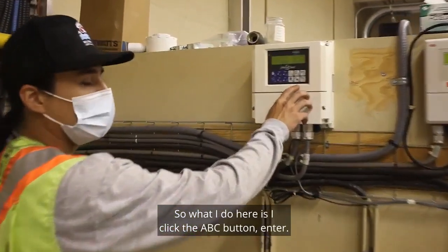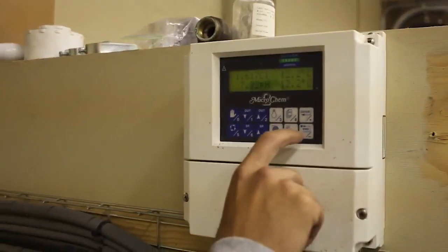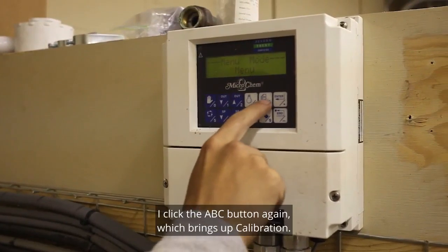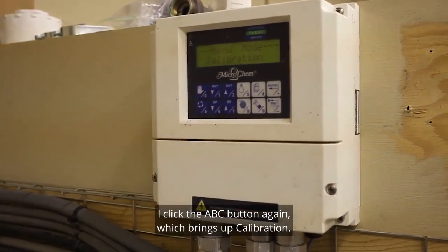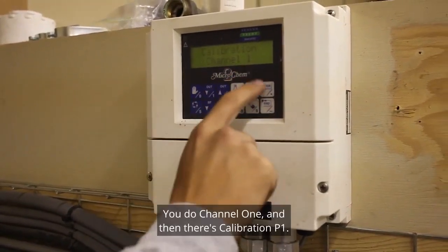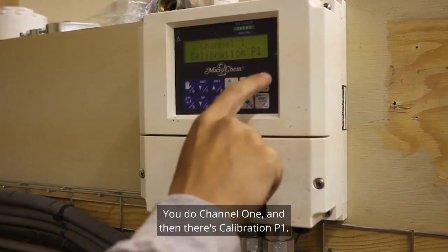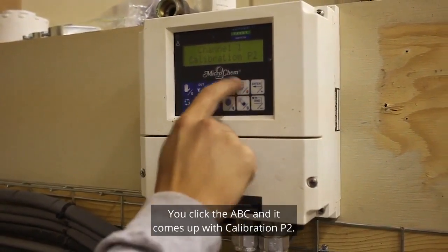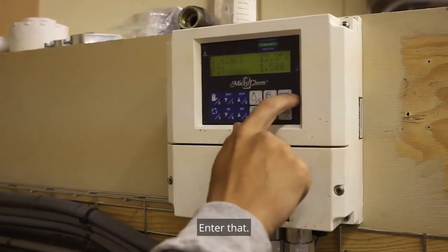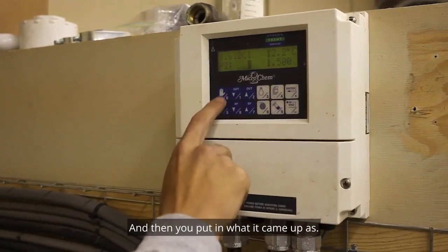To calibrate, I click the ABC button and press Enter. When it comes up to menu mode, I click ABC again, which brings up calibration, then click Enter. You select channel 1, and then there's calibration P1. Click ABC and it comes up with calibration P2. Enter that, then Enter again.